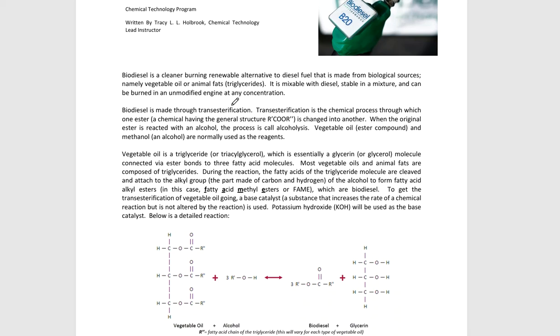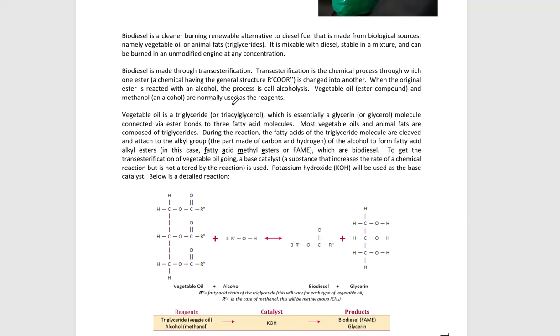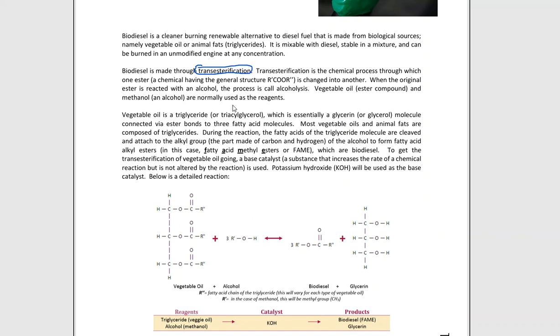So here in the background, you're going to see a small blurb about the types of reactions that are happening in this lab experiment. So first off, what I want to talk about here is this idea of what we call trans-esterification. Trans-esterification is an organic type of reaction that goes on, in our case, in a huge reaction flask. What happens, trans means to convert, right? So we are converting esters because it says esterification. So what's happening typically is that we're starting with one type of ester and we are making a new one.